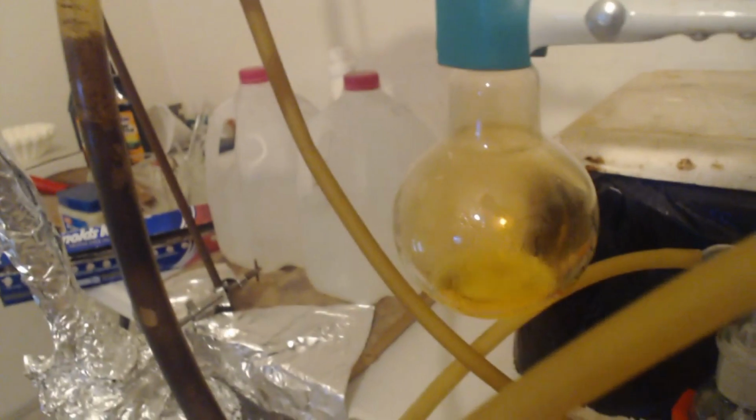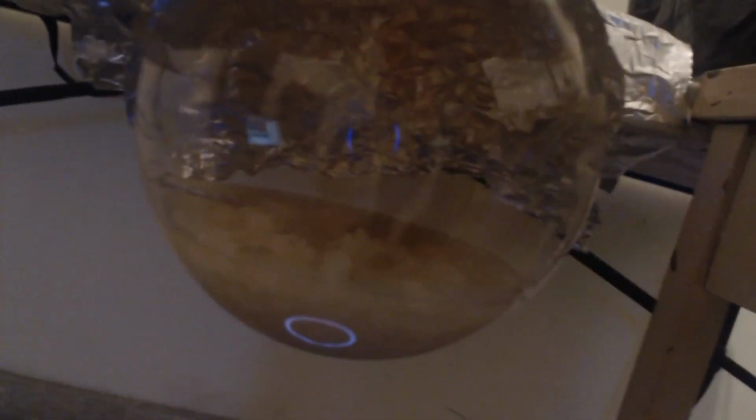And once it cools down, like right now, where there's not that many gases, it's not that bad. Definitely, if you have a fume hood, use it. See, the gases in the Vigreux column are gone. Alright, so I'm done. There's the receiving flask.